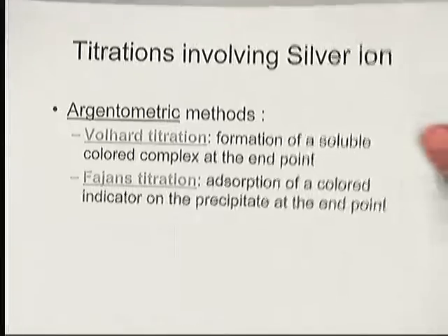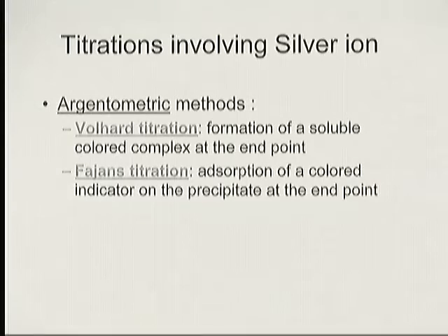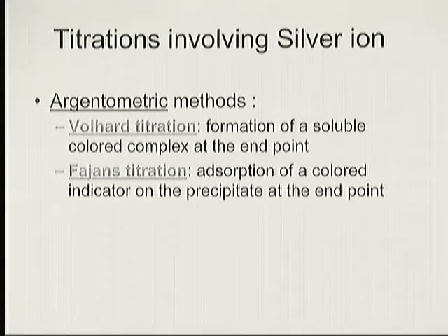Okay, let's begin with another video. This video is going to be pretty specific to a very specific class of titrometric methods, so it will be categorized or classified under volumetric analysis. You oftentimes see this in a chapter where you're talking about titrations. And the reason why is because we're going to be considering very specific subcategories of titrations.